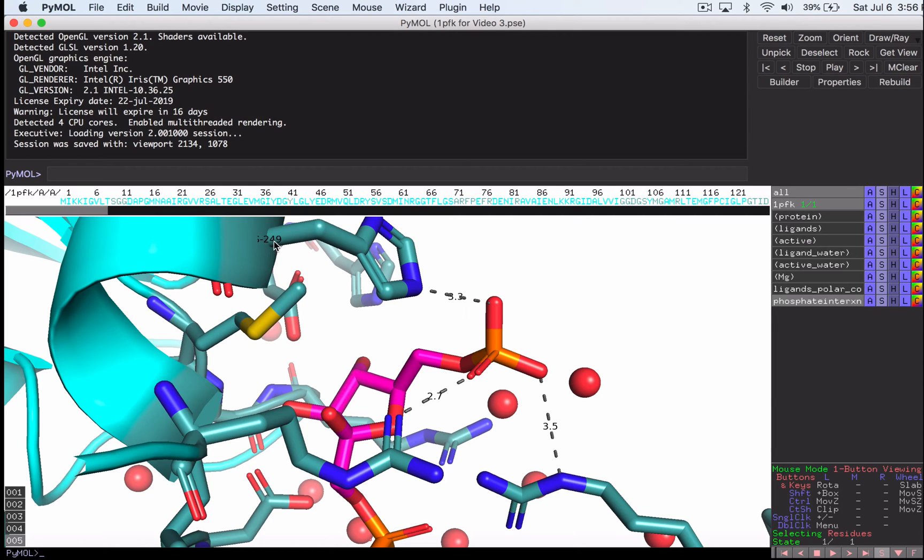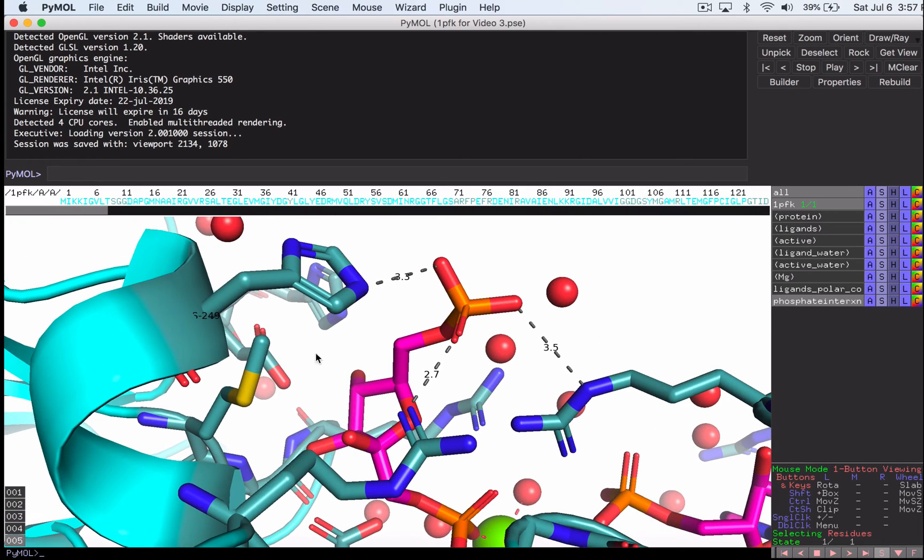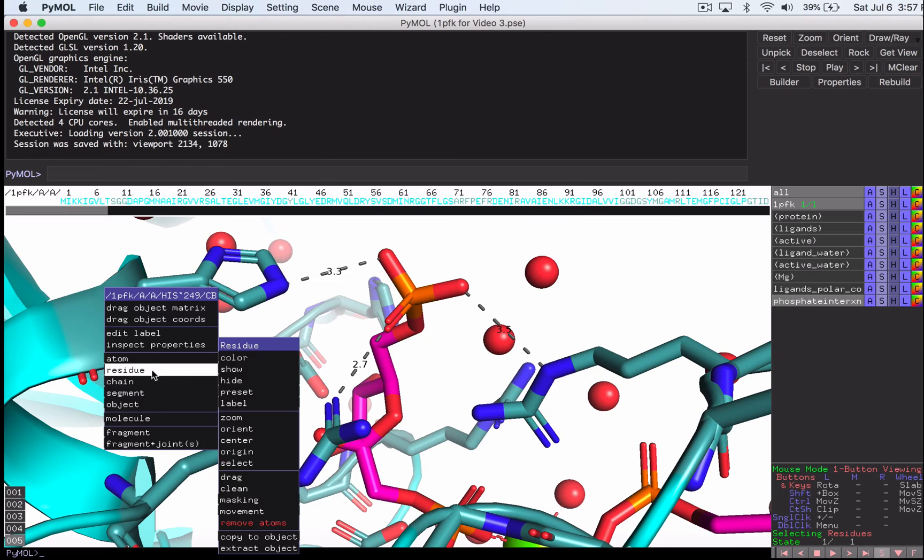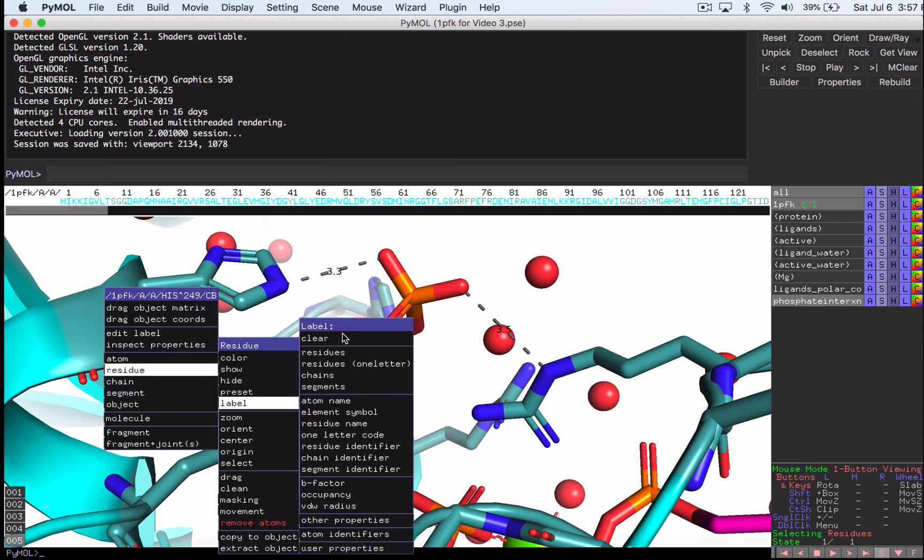So some people, actually it's going to be a capital, if we can get it into view here a little bit better, it's a capital H-I-S dash. So some people prefer to have capital H, lowercase is, maybe a space here, maybe a dash here. There's all different ways that people prefer you to show this. And so I'm going to show you how we can put on any custom label that we want. So again, let's right click on this residue, Residue, Label, and clear it.